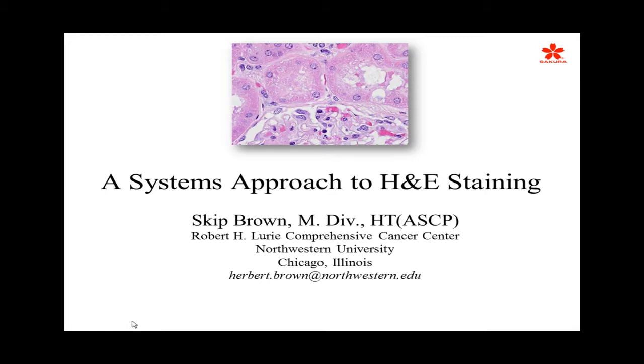When we talk about something as routine as the H&E stain, oftentimes this can get overlooked because we do this every day. We don't really give that much thought to it. But I think once we go into this presentation today, you'll see that it actually is not a routine stain. It is a very specialized stain, specific for special entities within the tissue.